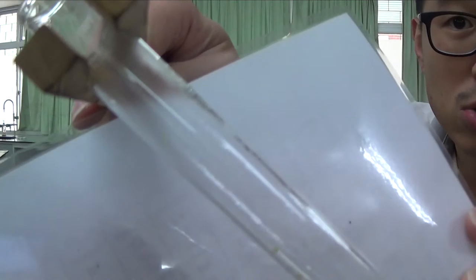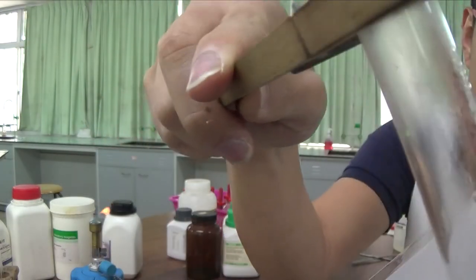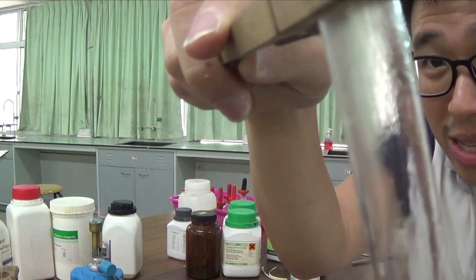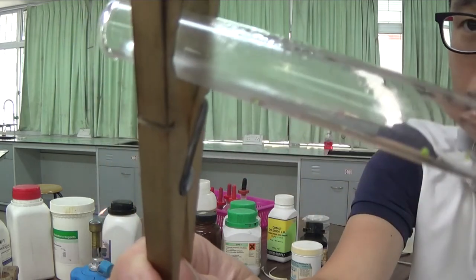But first of all, do you see the upper part of the tube has got some colorless liquid around it? You've got condensation inside because there's colorless liquid. It's not a green liquid, it's a colorless liquid formed on the upper part of the tube. That is what you see, a colorless liquid formed on the upper part of the tube.